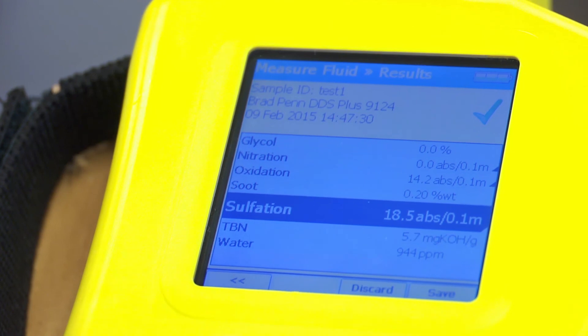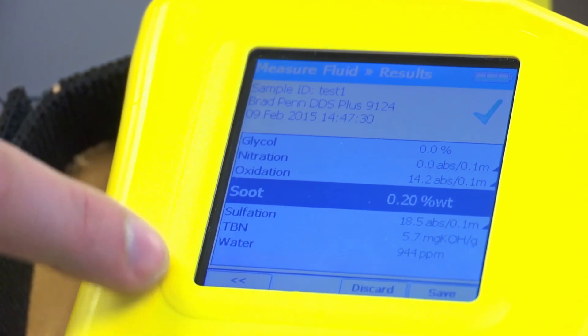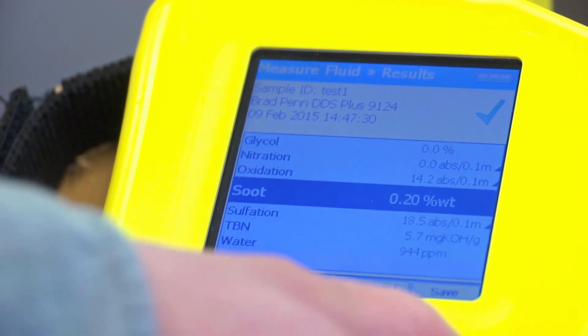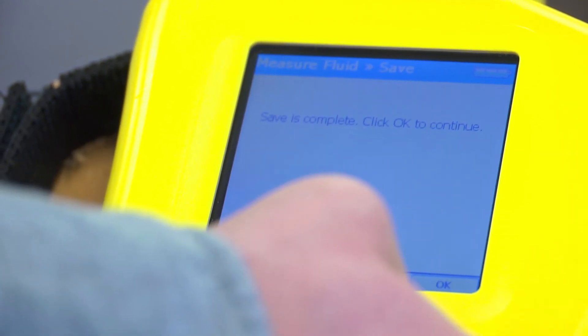This is important to note because for other industries such as hydraulic oils, soot would not be a present parameter because it is never really of concern. Looking at this, you can then save the data and hit save. Once the save is complete, you have completed one test. It is quick, easy, and takes under five minutes.